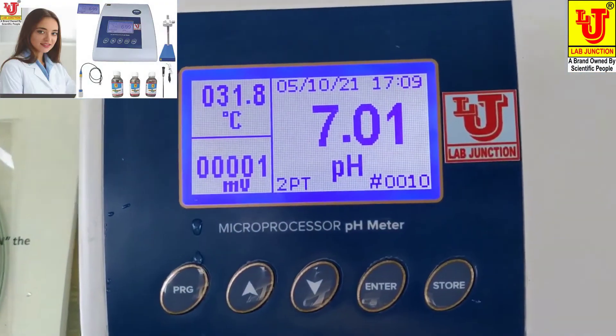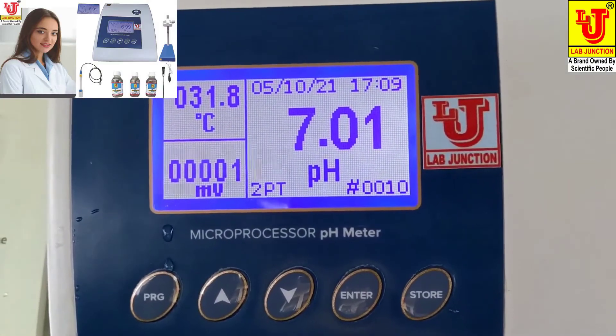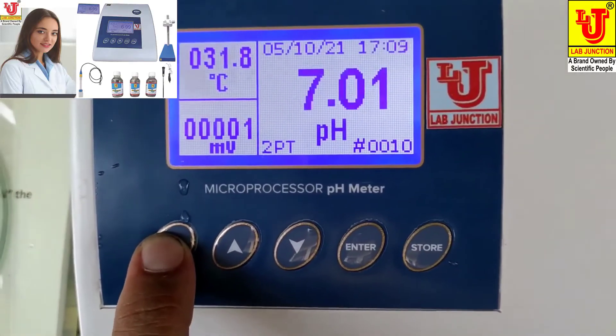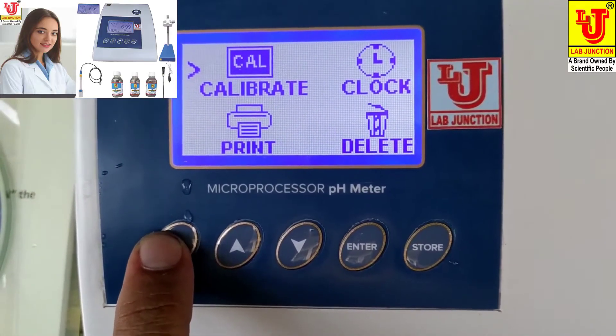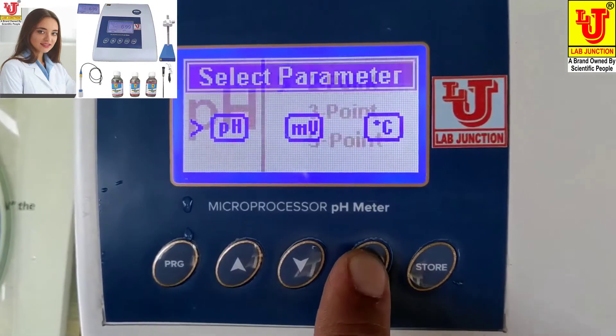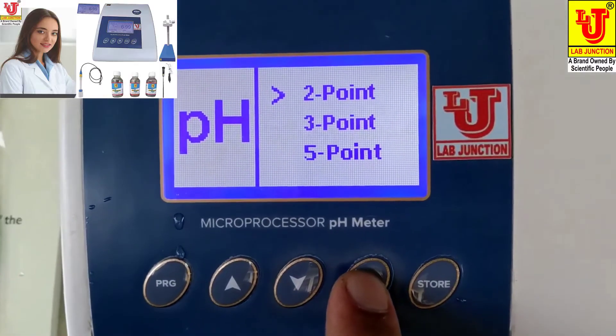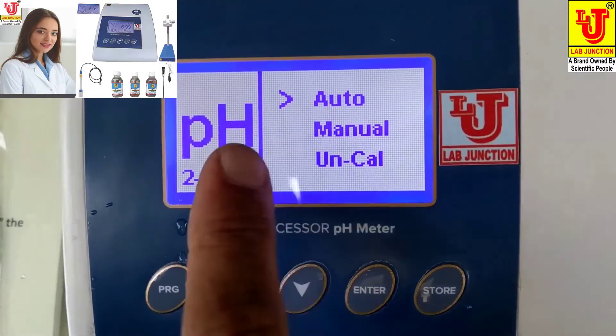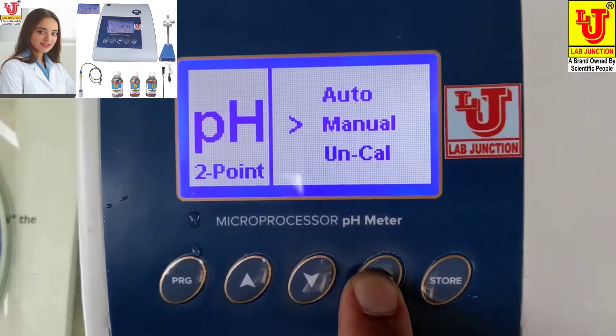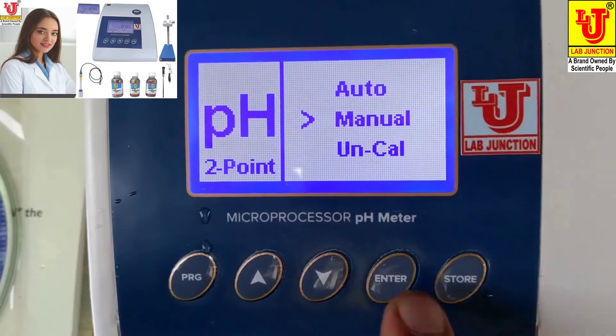Now next mode is, again enter on calibrate key, again pH enter. And this is two-point calibration. You go to manual mode and press enter. Now you can calibrate to manual mode, enter.